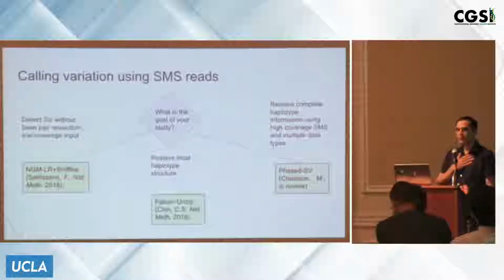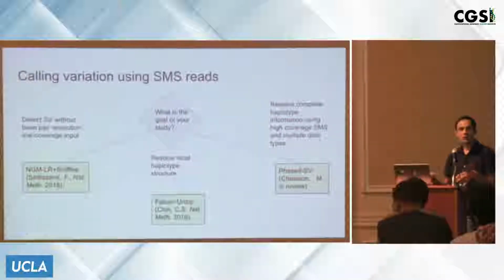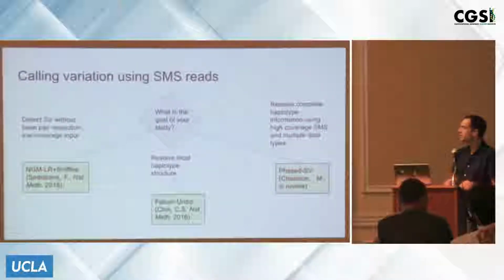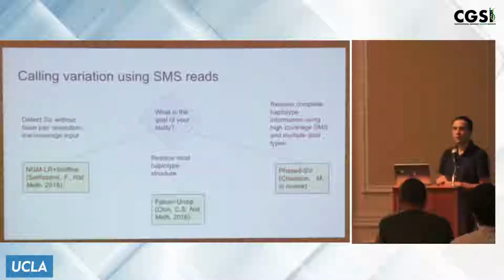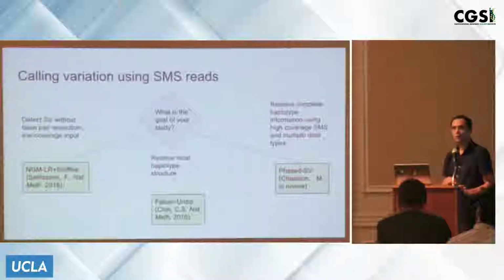So the method I wrote, Blasr, it's now about 10 years old. 10 years in code length is about the same as in dog years, so that program is pretty much ready to not be used anymore. I did some timing runs yesterday, and to map about 100 million bases took 47 seconds with NGMLR and about 30 minutes with Blasr. So it's not terribly competitive anymore. It was good back in its day.